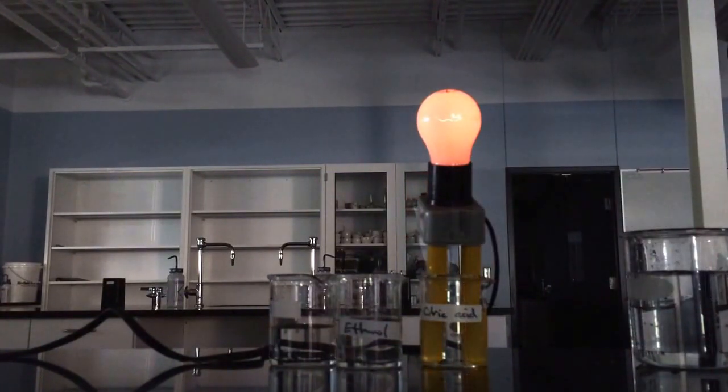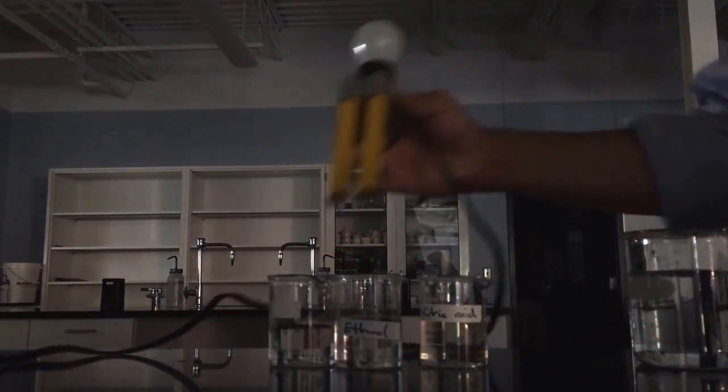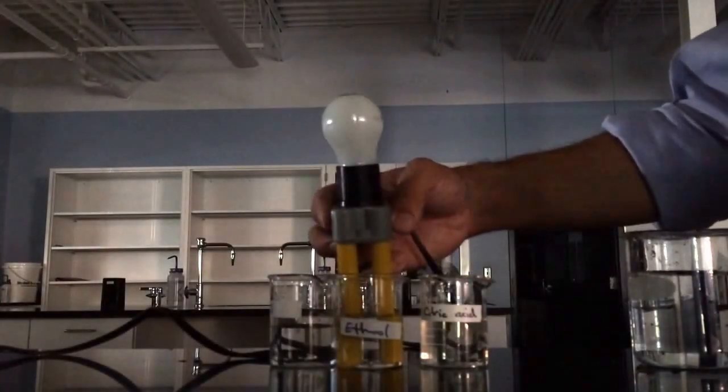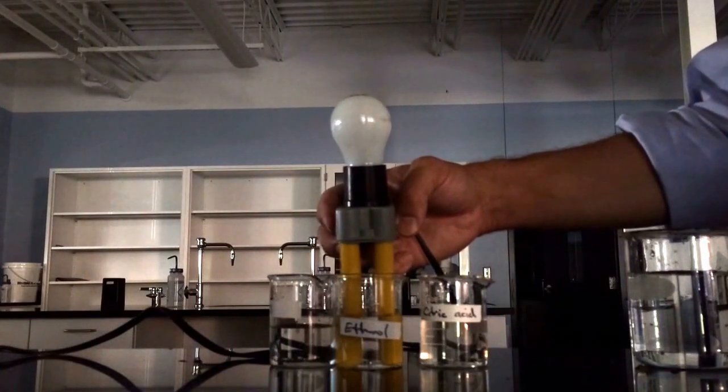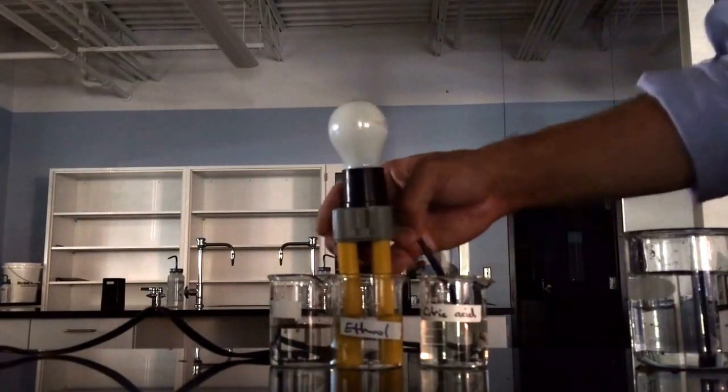And so what this means is that citric acid is a molecular compound. Somehow it's producing ions. This is going to lead us to the one exception to the molecular compounds not dissociating that we're going to find when we get to acids in a couple of weeks. Right now, we're going to stick with the either or, the conductive ionic compounds and the non-conductive molecular compounds, but we want to keep in the back of our heads that later on we're going to come to the exception, which is going to be the acids.